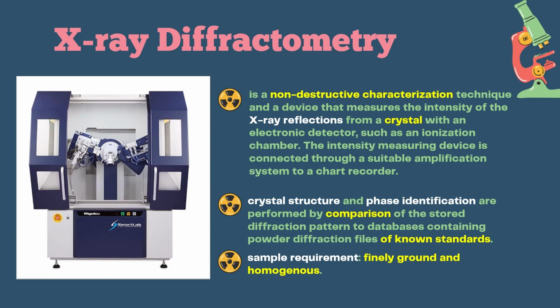The XRD is a non-destructive characterization technique and a device that measures the intensity of the X-ray reflections from a crystal with an electronic detector, such as an ionization chamber. The intensity measuring device is connected through a suitable amplification system to a chart recorder. Crystal structure and phase identification are performed by comparison of the stored diffraction pattern to databases containing powder diffraction files of known standards.